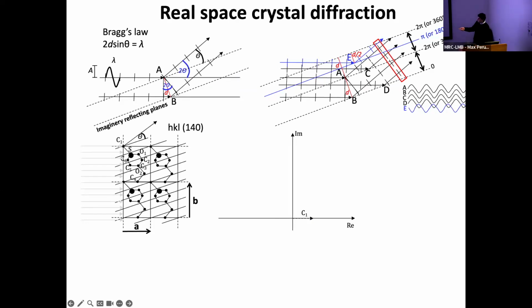So we're going to use our C1. We can represent the amplitude as the length of the vector, and the phase as the angle with the real axis. Our C1, we know it's got phase 0, so it's lying flat. It will have an amplitude of about 6. The amplitude is dependent on the number of electrons. The more electrons the atom contains, the bigger. Let's say C1 contains 6 electrons, so we get a number 6.